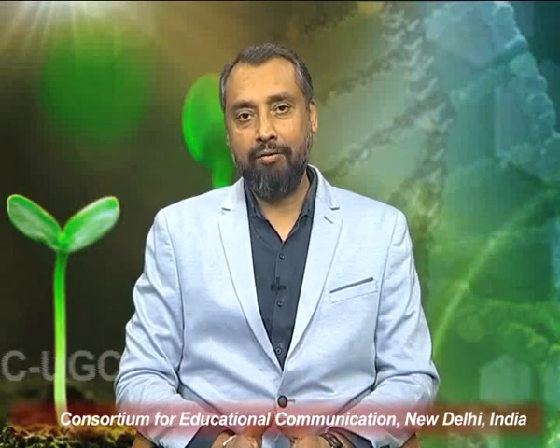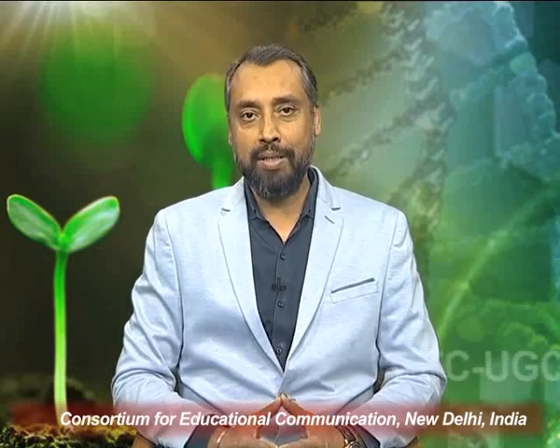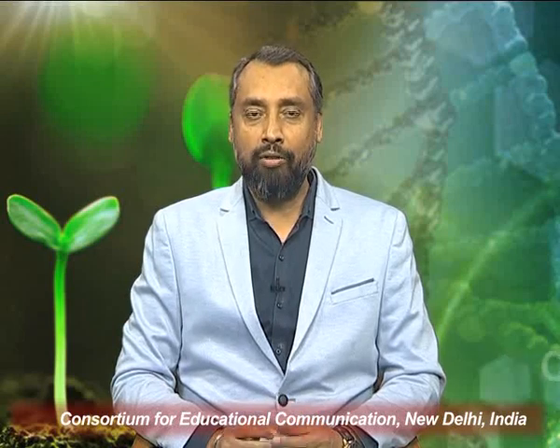Now from there on we shall continue to discuss one of the most important and very crucial equipment which is used in any tissue culture lab. Today in this lecture we shall be talking about two very important equipments called laminar flow equipment, also called laminar airflow hood, and autoclave. We shall talk about the general introduction about the equipments, how they look like, what is their working principle, what are their uses and what are their limitations.